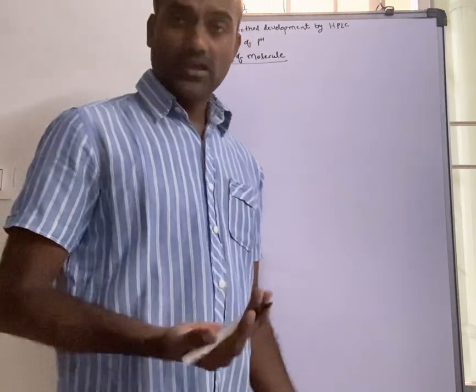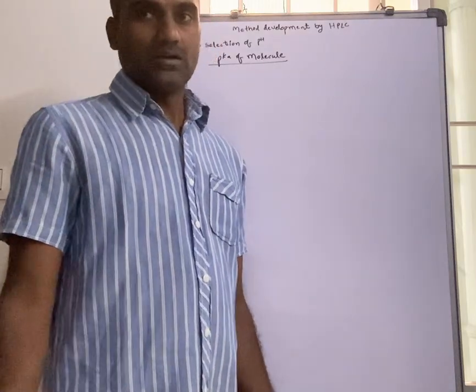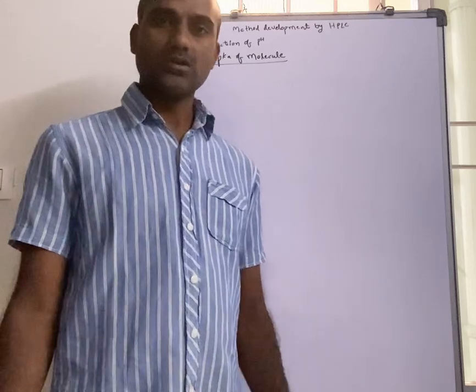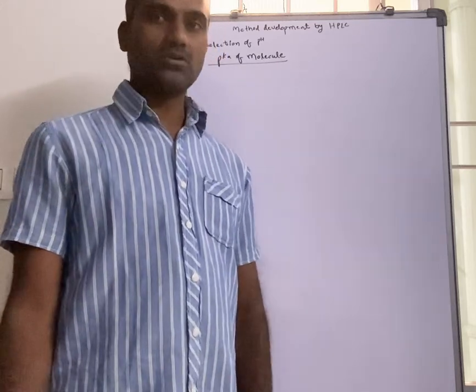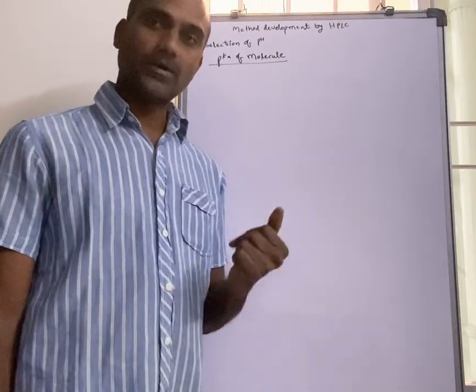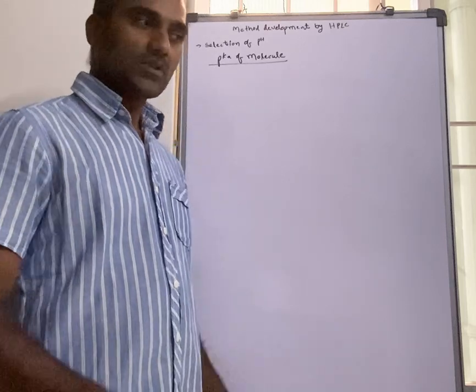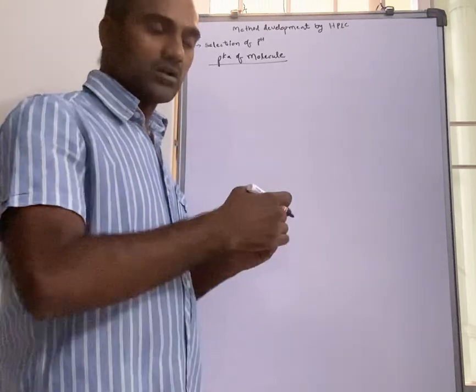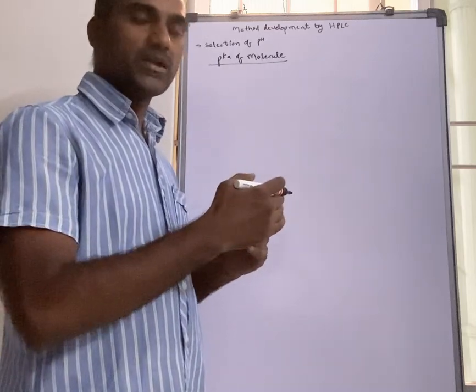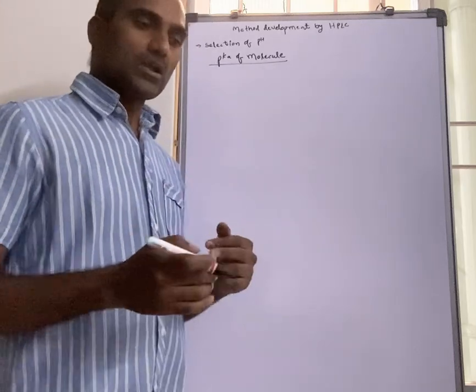How will we know the pKa value? If literature is already available, we will search and find the pKa of the molecule. If it is a new molecule, then we will determine pKa by potentiometric technique or by HPLC, where we inject the molecule sample in different pH mobile phases and run the chromatogram.